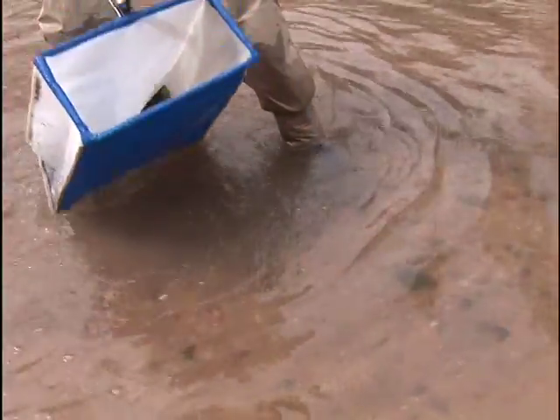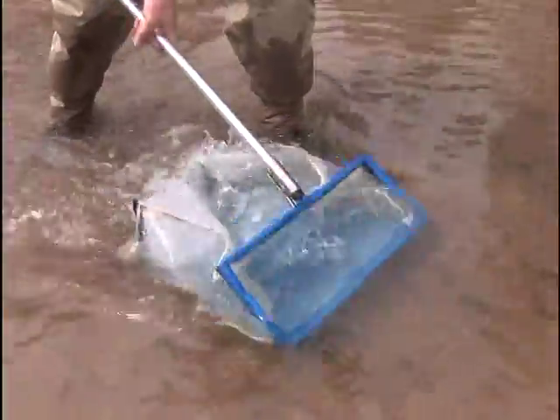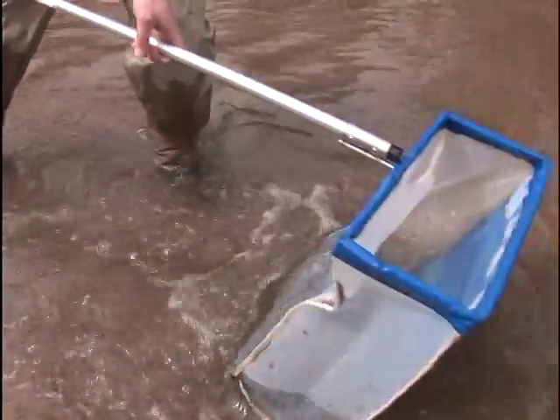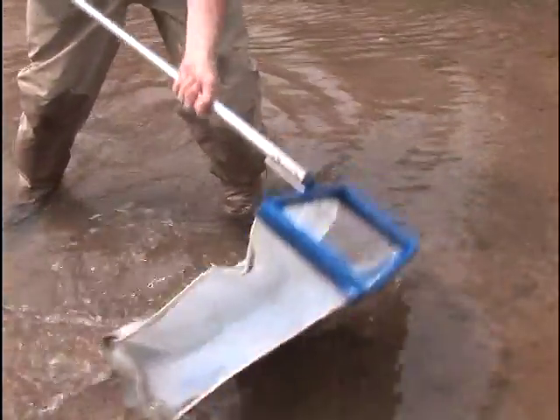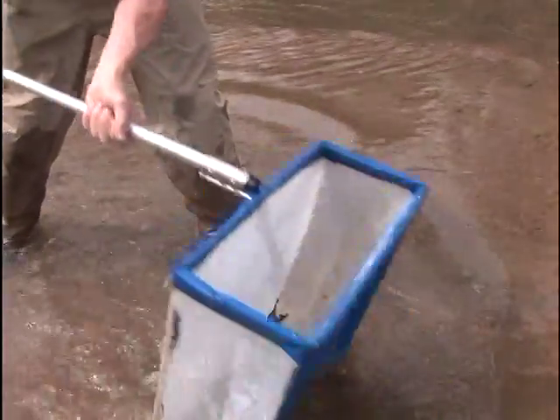As you lift the water out of the net, be careful that you don't lose any of the debris or matter that you've collected. Shake the debris down, using the water current to push all the debris and matter down into the bottom of the net.